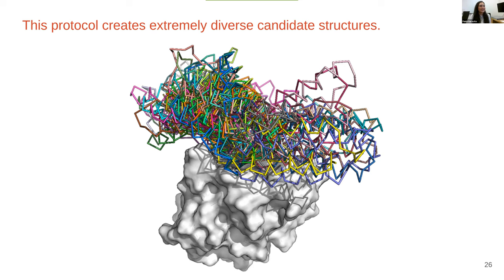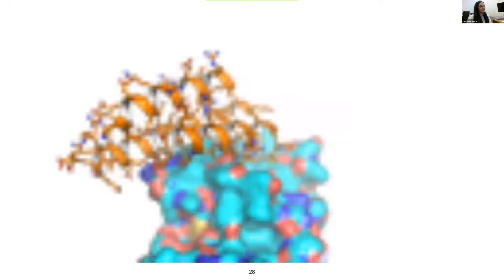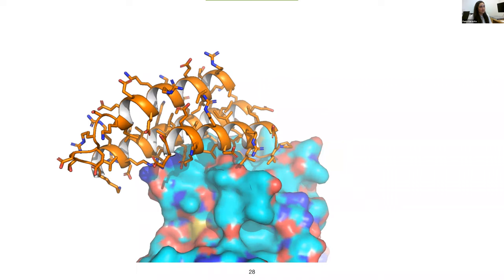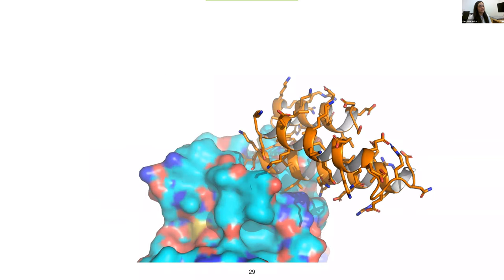Just because I really love what I do here, and seeing all the little mini proteins forming in different diversity, it was fun for me. Then I also have a few more designs so you can see what I mean. Again, the tryptophan is being kept in place, we're keeping it in a loop, but at the same time, we're giving the flexibility of designing more interfaces.